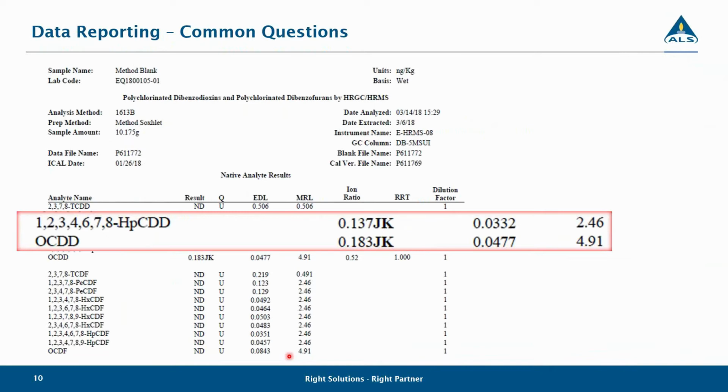Please note that EMPCs are not reported for regulatory or compliance samples, since having the ion abundances outside the expected range would mean all the peak identification criteria were not met for that result, and therefore would not be reportable in order to meet compliance rules. You also find an abundance of EMPC values at the very, very low levels.